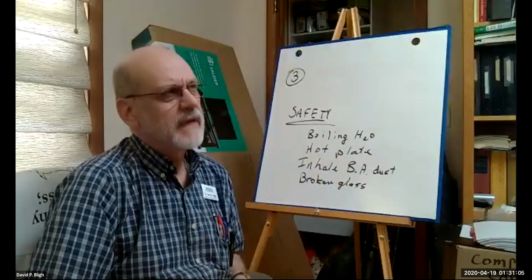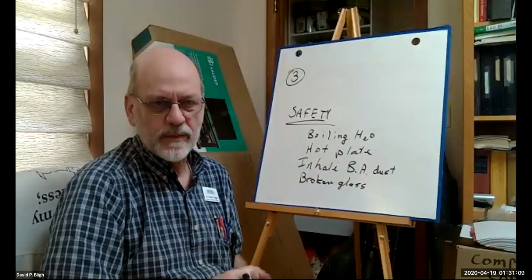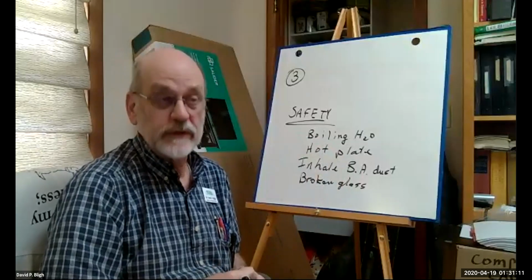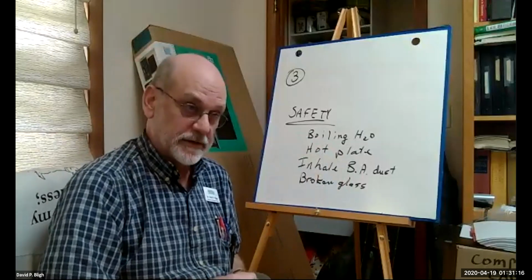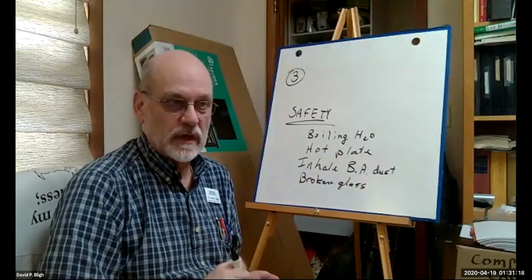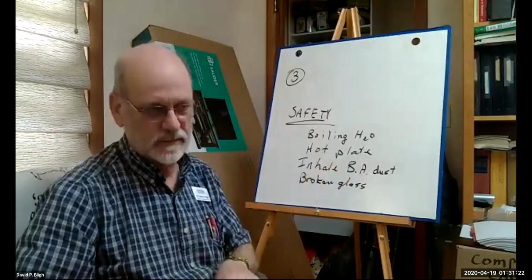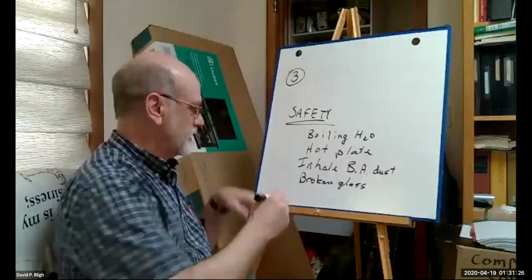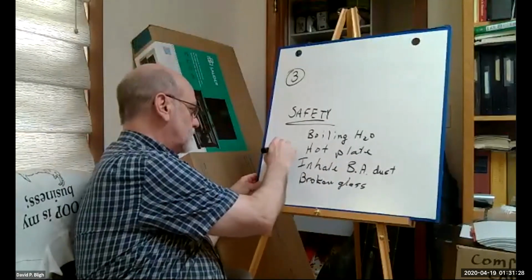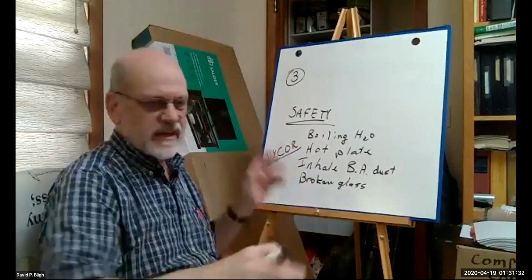Well, I take that back. On the Logan campus of Southern, we do have Pyrex tubes. Right? If I were going to do this at New River, I would use some tubes that I inherited from a former research career, and they are very expensive. They're made out of Vycor. But that's neither here nor there.